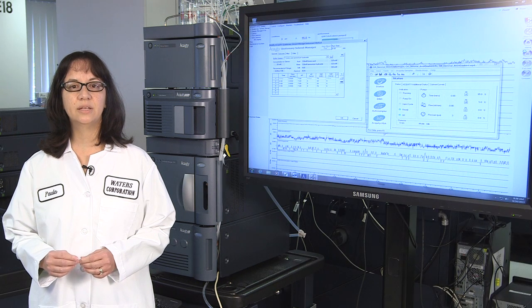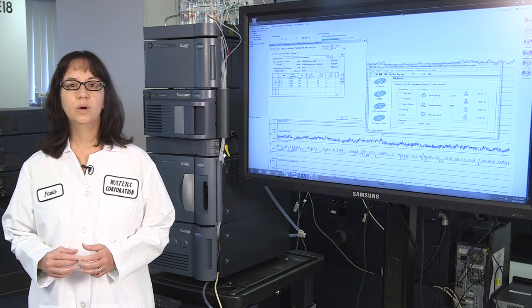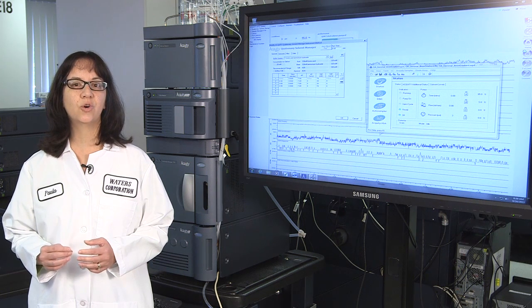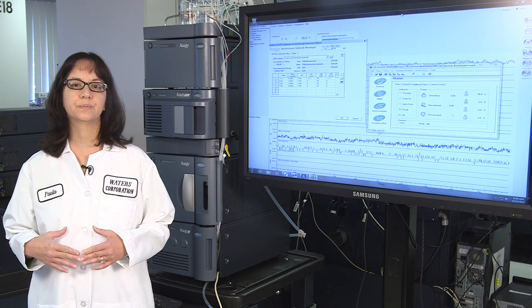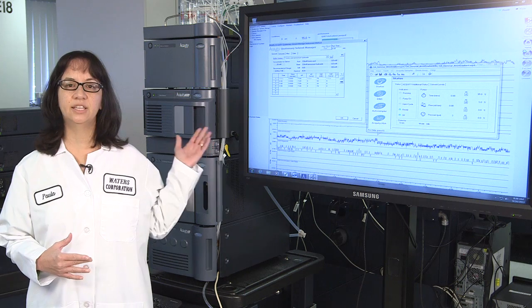Our technique is based on the established principle of acid-base equilibria, where a buffer of desired pH can be created by mixing solutions of a weak acid and its corresponding salt or base. To accomplish this, first we configure the instrument like this one.